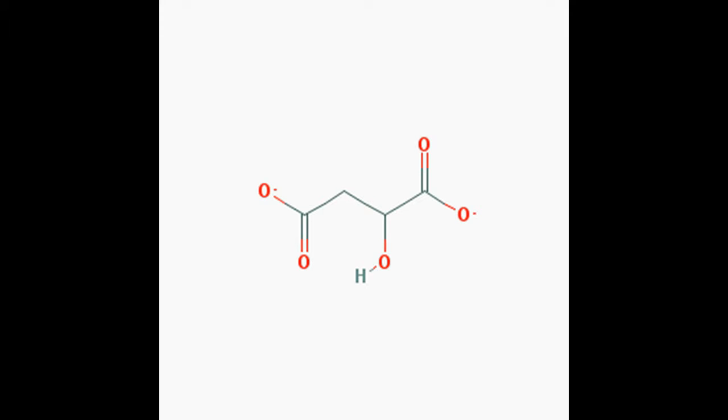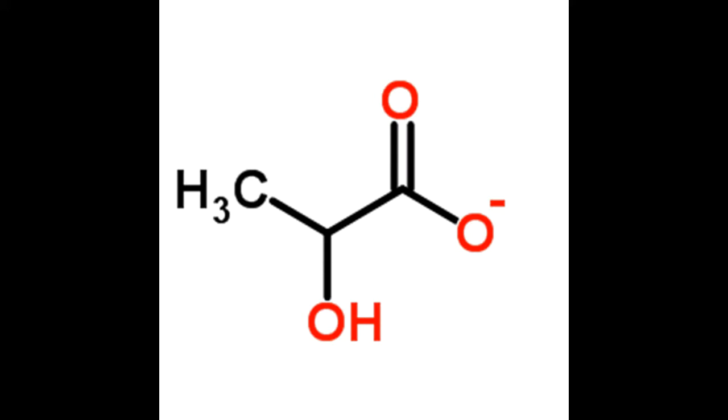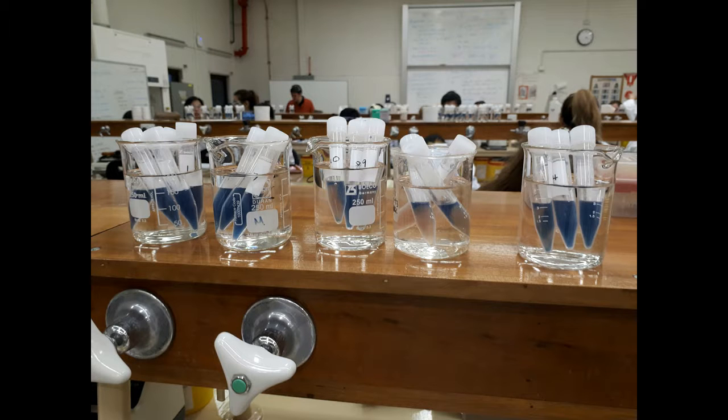The malate and lactate solutions that did not contain NAD did not lose their color as they did not contain any carrier molecule to transport their electrons to the DCIP. This obviously meant that the DCIP could not be reduced and hence retained its blue color.